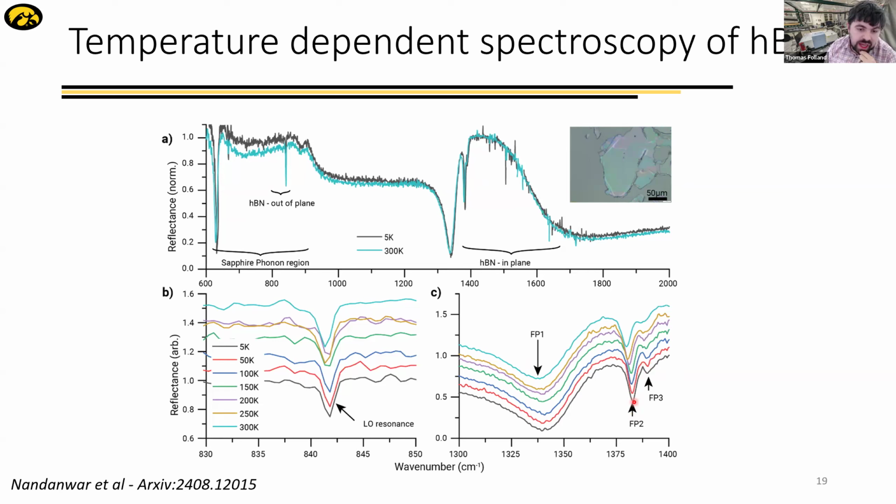So, and if you look very carefully, it's hard to see. You might even be able to convince yourself that peaks in this spectrum actually change line width as well, which suggests that the phonon lifetime of this material is changing.